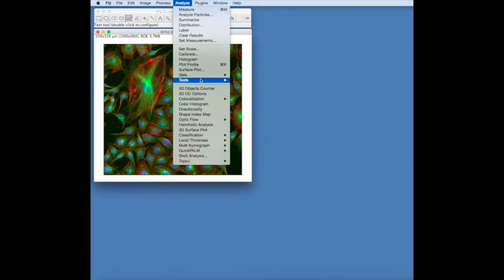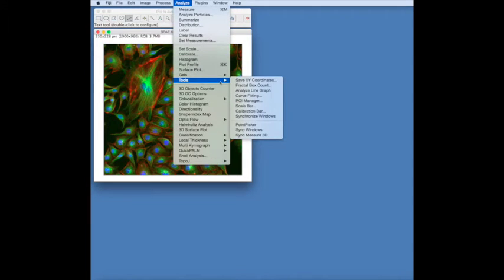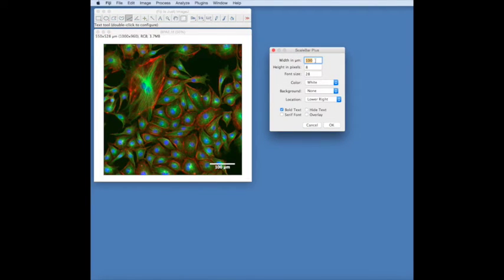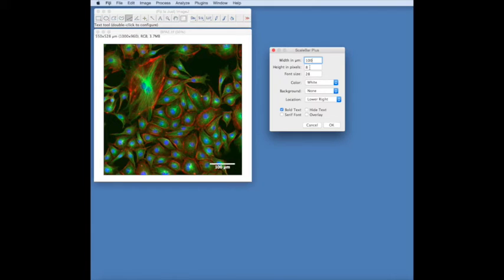To add a scale bar, we can go to Analyze Tools Scale Bar, and we can change the width of the scale bar in microns in this case, the height of the scale bar in pixels.